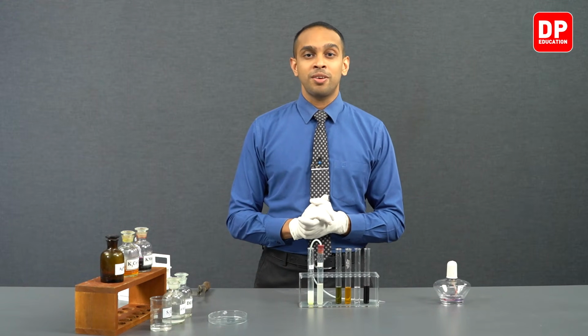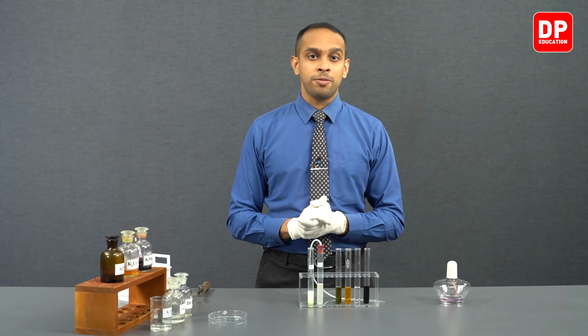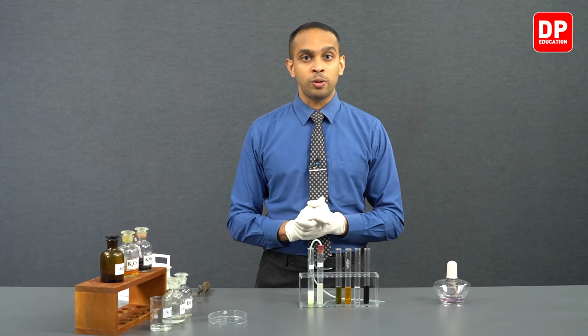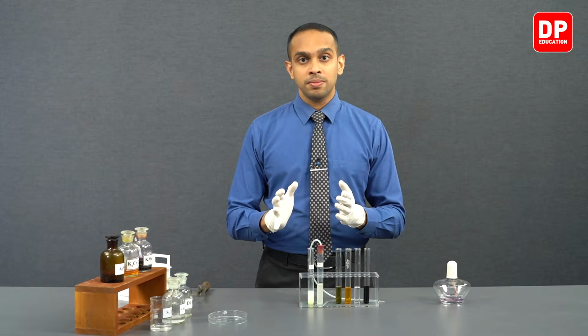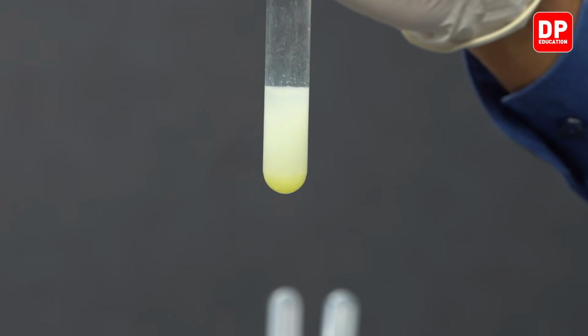Students, in the very first part of the identification test that we conducted for the thiosulfate ions, we added hydrochloric acid to our thiosulfate ion solution and we produced sulfur along with sulfur dioxide.